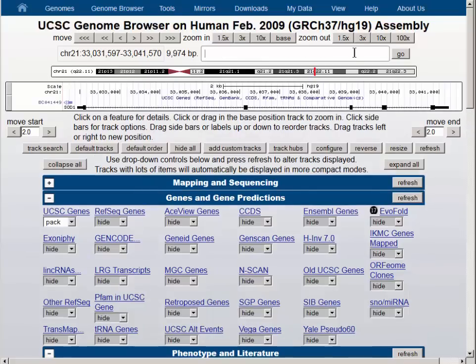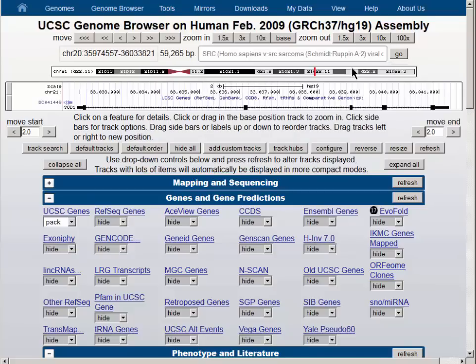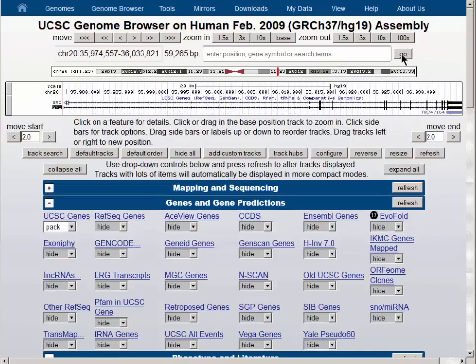The default gene here is the SOD1 gene. We will go to another gene, the SRC gene, and choose that from the list. The go button will take us there. The reason to show you this gene is to demonstrate that occasionally the canonical gene for a particular gene is not the largest transcript.